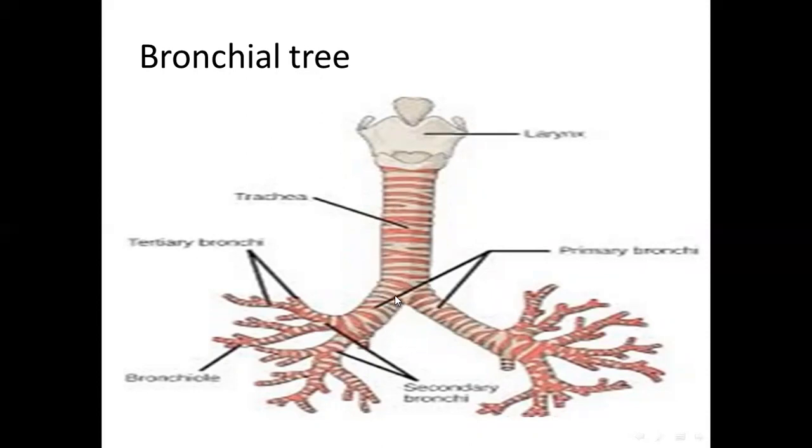By the way, the bronchial tree is composed of the airways that are located outside the lung. تمام. اللي هي ال primary bronchi أول ما نجي. بعدين أو نسميها extra pulmonary primary or extra pulmonary bronchi.